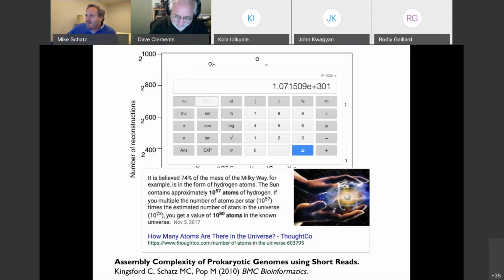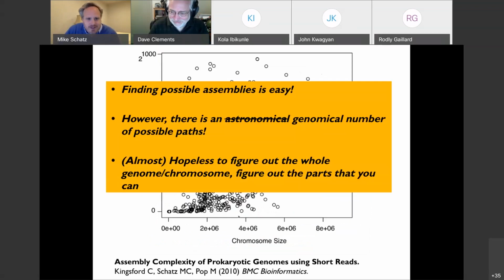So, from a genome assembly, especially from short reads, the process is very hierarchical. We're going to chop them up into even shorter reads, lay out how they're all related to each other, try to compact it down. We're going to try to do this over the segments that are unambiguous, although inevitably there's going to be repeats that are going to make it ambiguous.